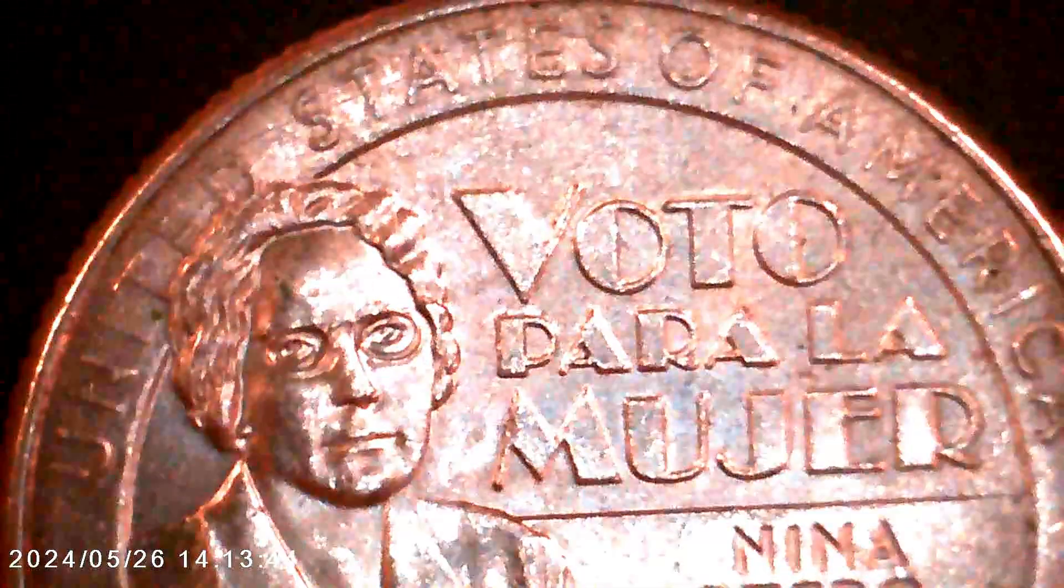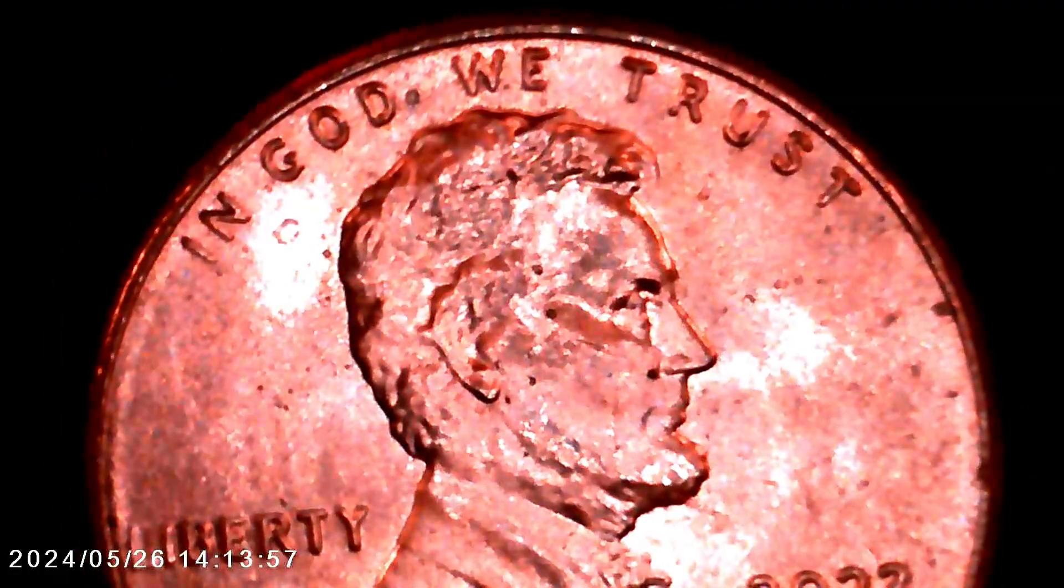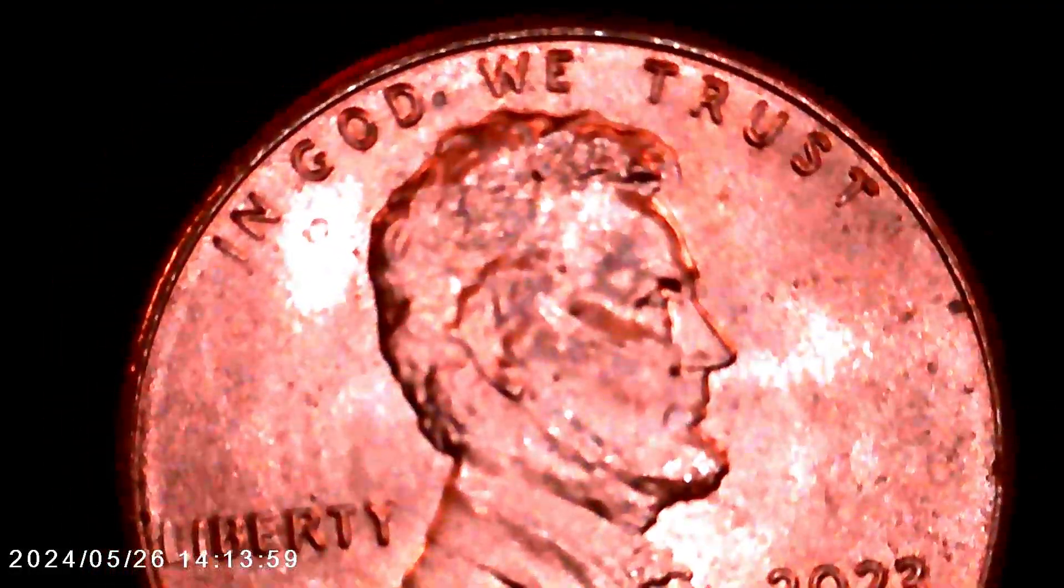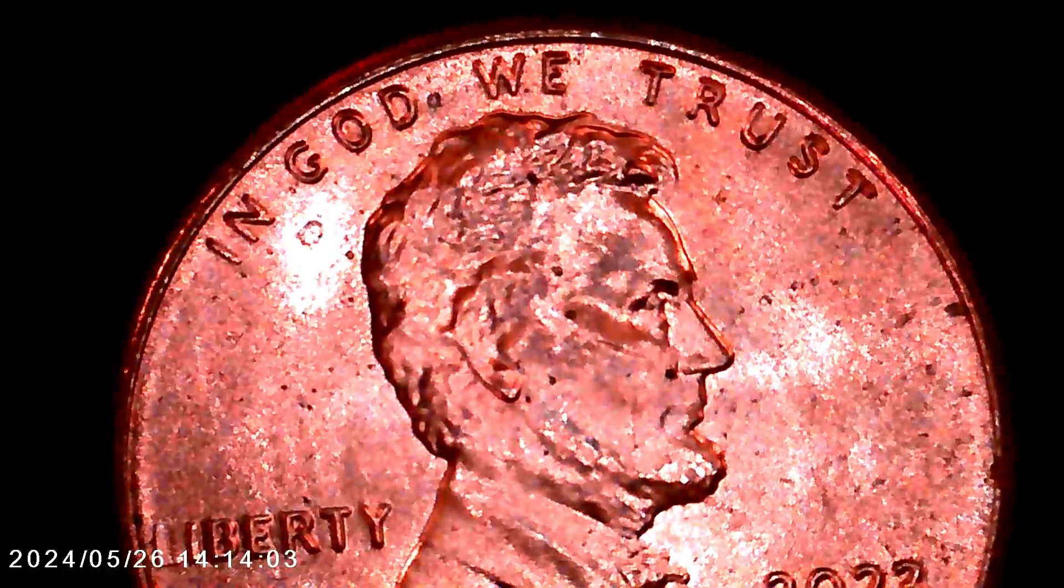Right here I've just shut out the LED lights that are in there and that's what it looks like under just plain room light like that. Now onto a penny. That's copper. And once again we'll get that right into focus there.